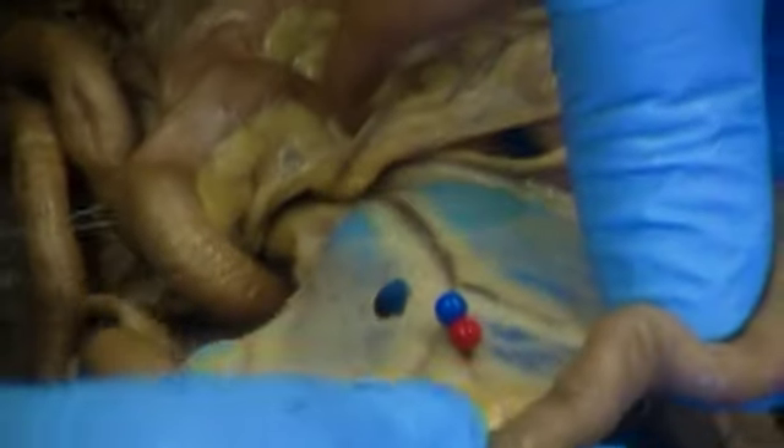Before moving on to the large intestine, this red and blue pin is pinning this membranous structure with blood vessels in it — that is the mesentery.